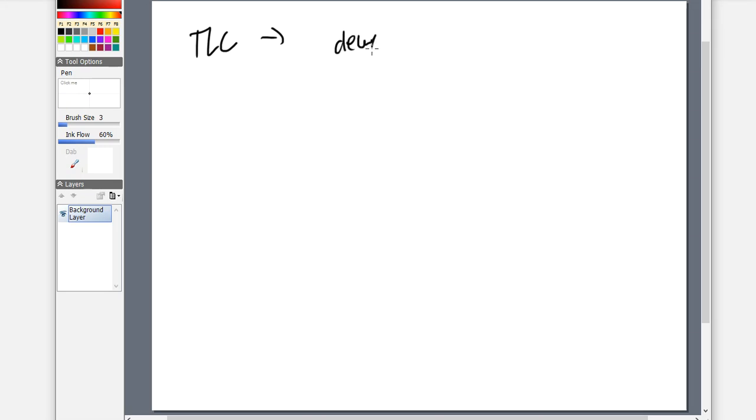So first off, we need to talk about the chamber configuration, and we've already mentioned this term developing solvent, and the developing solvent is what I am making in a laboratory environment and mixing together. Then I'm going to pour that into the chamber, and when I do that, I'm going to put a lid on it, and we said that a gas phase begins to form. So I'm going to allow some time for the gas phase to generate and fill the upper parts of the tank. And then the developing solvent is slightly changing, and it's making the more appropriate mobile phase that is staying in the bottom of that tank, ready for my plate to be inserted.